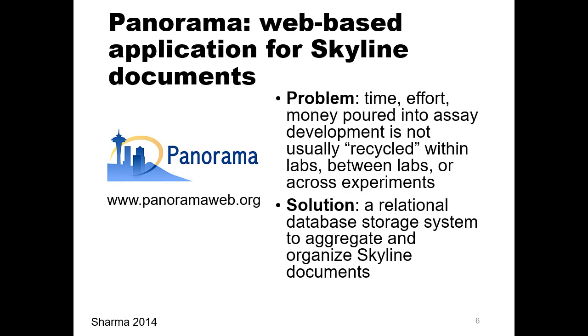But first, just a very quick review of Panorama. You just heard a lot about it from Vigisha. Now I'm just going to reframe it from the point of view of an experimentalist. I am a data generator, and I am creating all of my data. This is how I view Panorama. The problem I saw was that researchers like me were pouring all of this time and effort and money and sanity into developing a mass spectrometer assay, and then it would die.